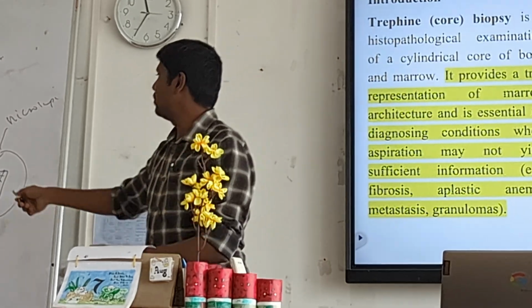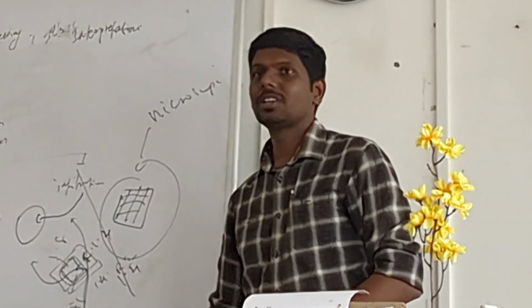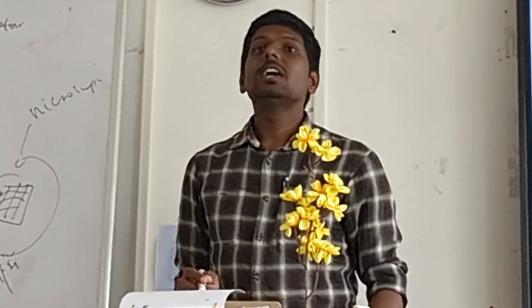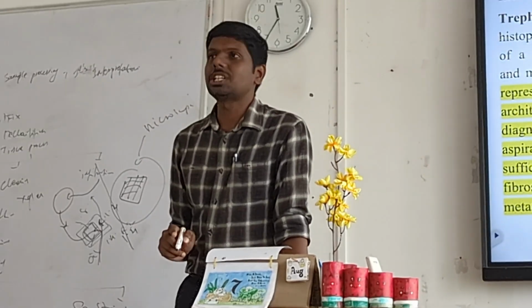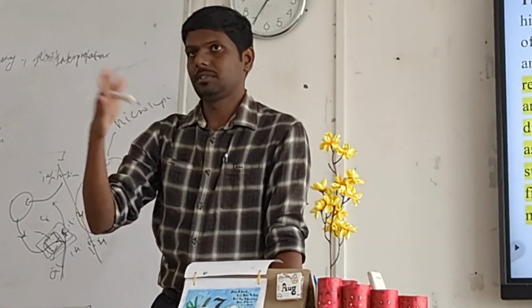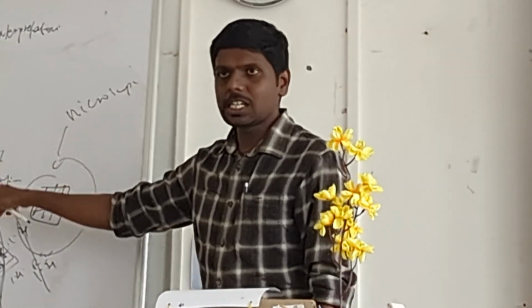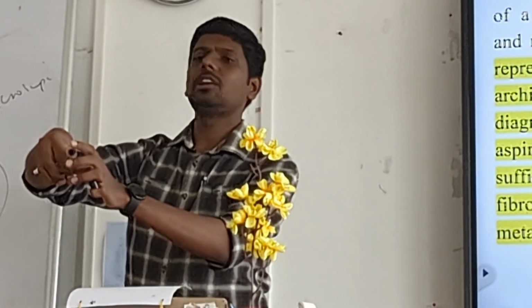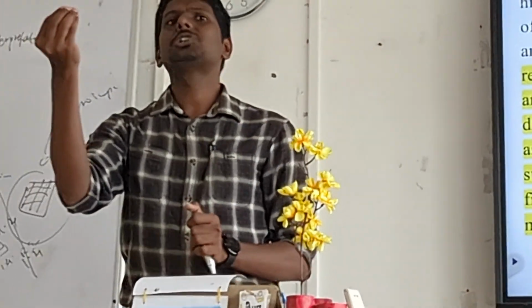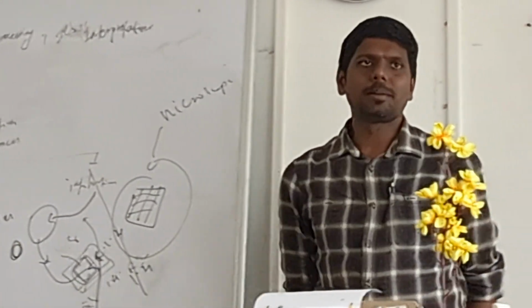That is called infiltration. Now the wax will enter inside the tissue. Xylene will come outside. That is why this step is called infiltration and impregnation. Infiltrating of wax inside and impregnating outside. Something coming out, okay? Infiltration and impregnation. After suspending tissue in this liquid wax, if we remove and let it dry, what happens? It will become a hardened tissue. Okay, a small hardened waxy meatball will be there.